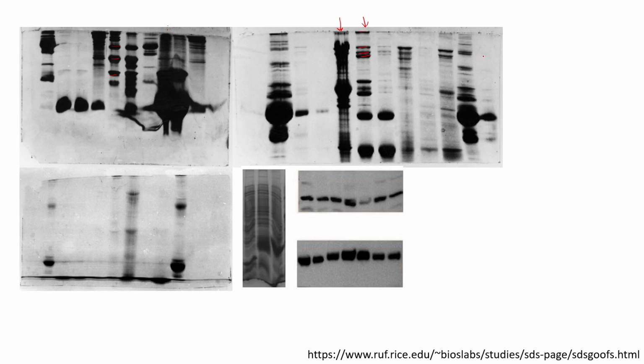So what precautions should you take so that you get a clean gel with well separated bands? These kinds of gels are not appreciated. They look very bad and are not conclusive. You cannot conclude any result out of them.